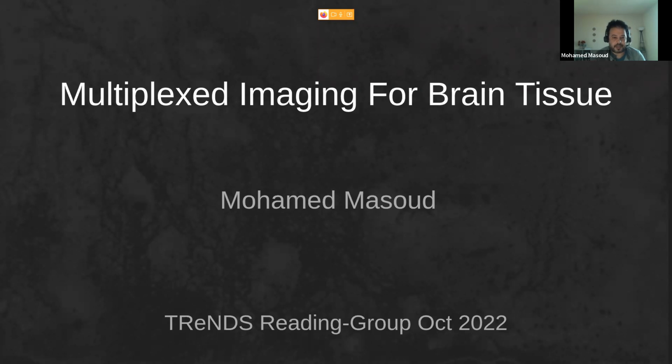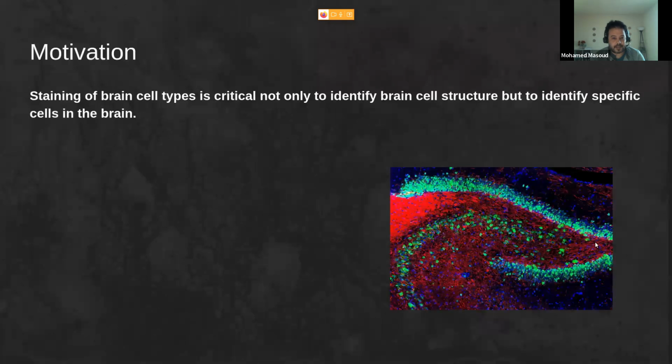The motivation for that is that we are trying to capture the cell localization and cell type in the brain.